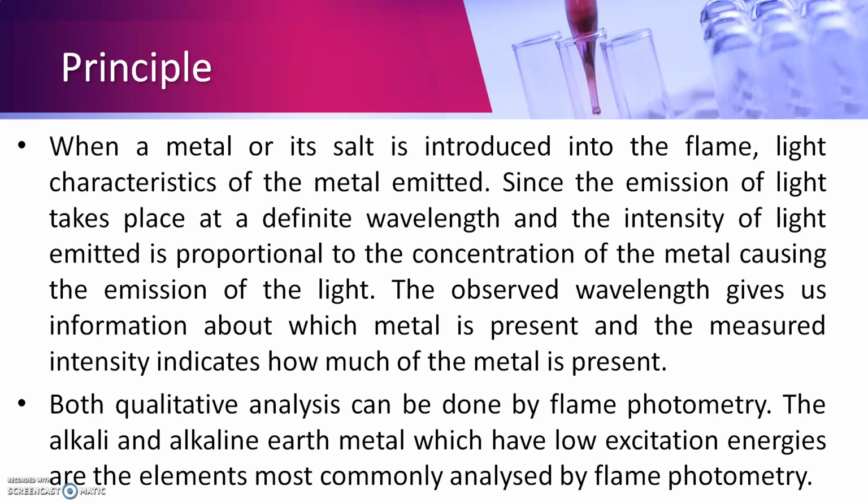The emission of light takes place at a definite wavelength, and the intensity of the light emitted is proportional to the concentration of the metal causing the emission. The observed wavelength gives us information about which metal is present, and the measured intensity indicates how much of the metal is present.